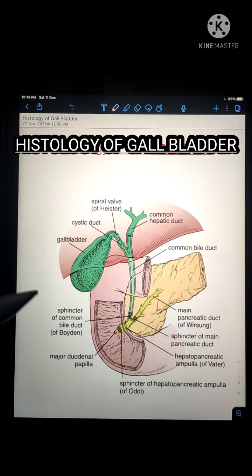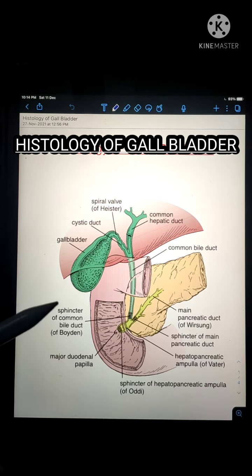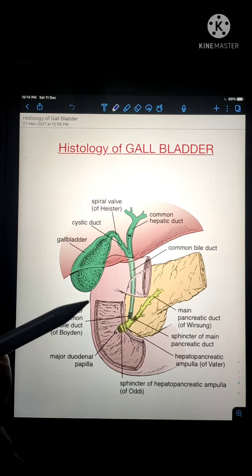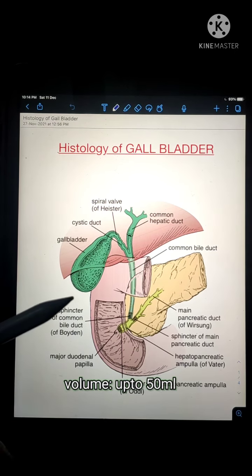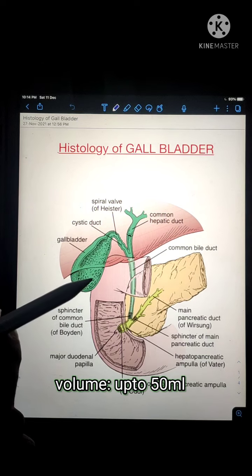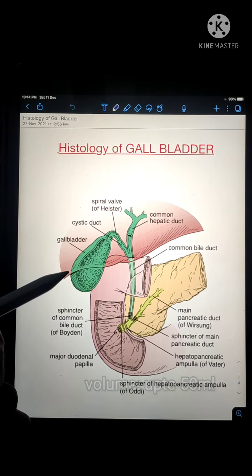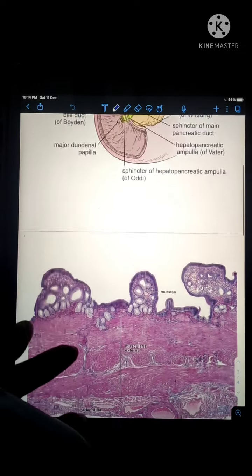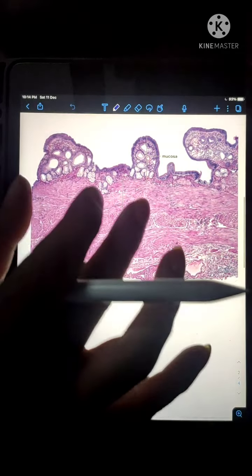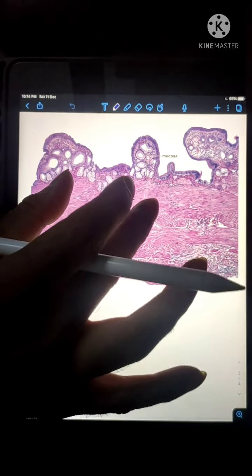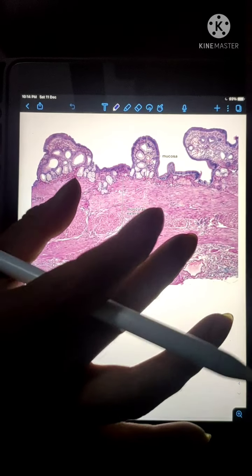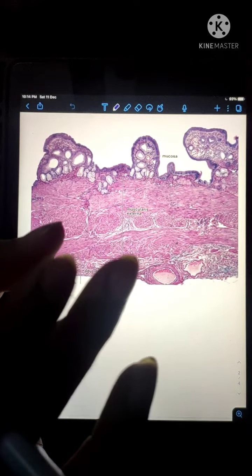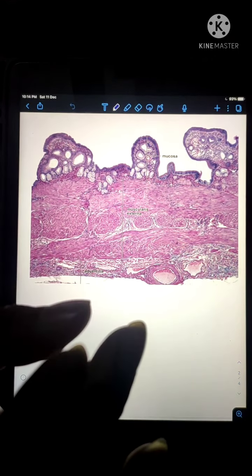Today we are going to talk about the histology of the gallbladder. The gallbladder is a pear-shaped distendable sac which stores and concentrates bile. This organ is attached to the under surface or the visceral surface of the liver. When we take a look at a section of gallbladder under the microscope, the first thing we see are the three layers of the microanatomy: the mucosa, the muscularis, and the serosa or adventitia layer.